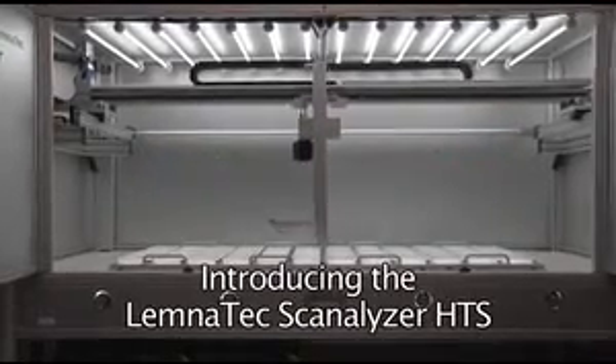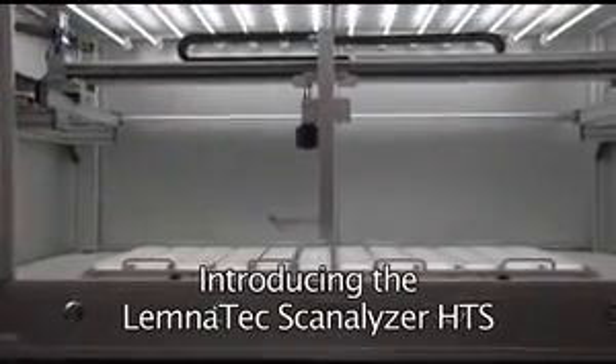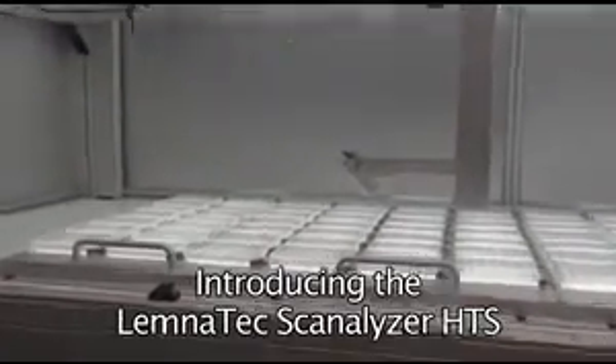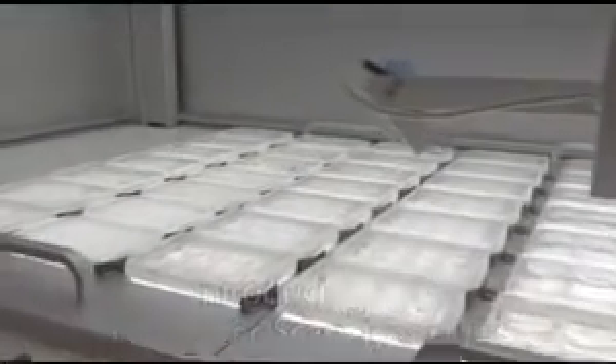These technologies are fundamentally important for many fields of applied and basic research, enabling the examination and understanding of different plant gene functions and the overall effects of chemicals on various organisms.